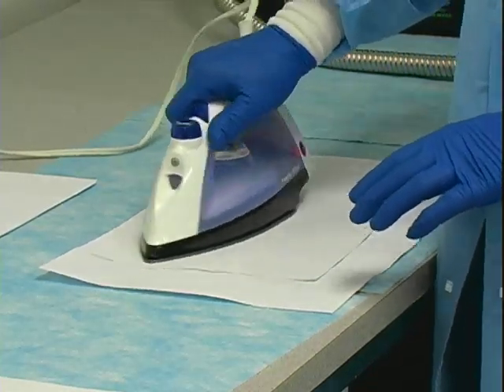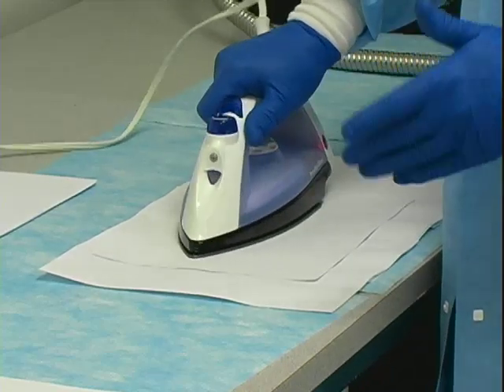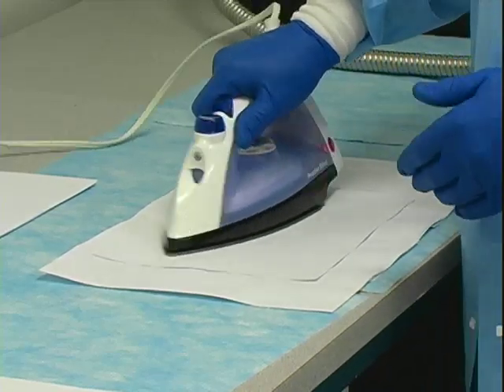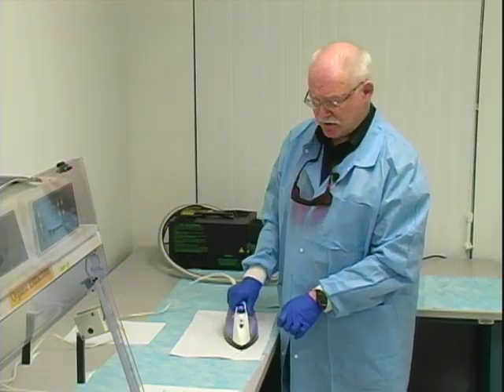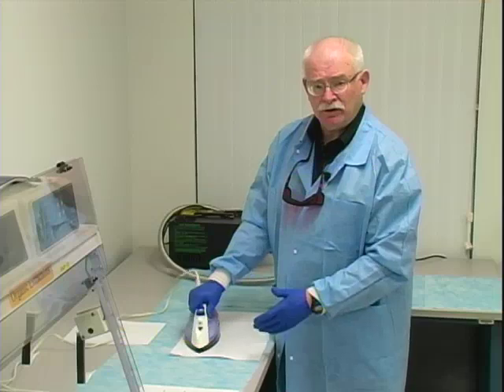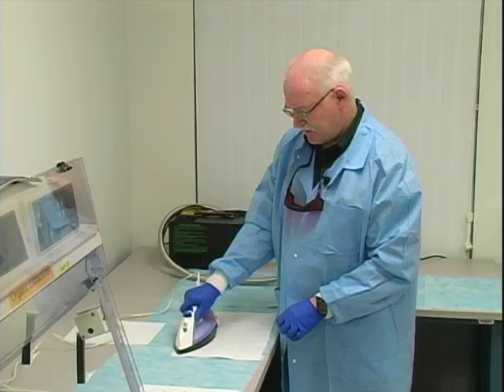This compares very favorably to the recommendations for application of heat for DFO, in that that process is often as much as ten or twenty minutes in an oven. So this is obviously quite a bit faster.